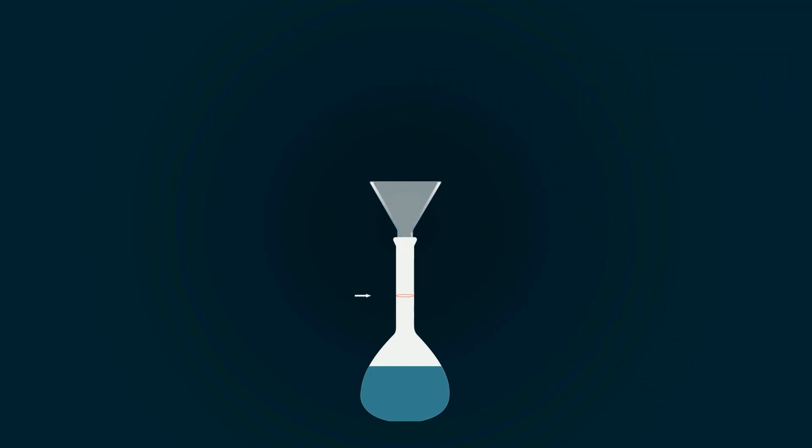You will have to add more distilled water to reach up to the 1000 milliliter mark. So we add more distilled water.